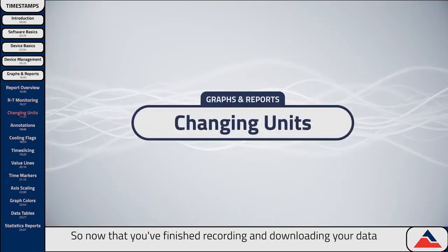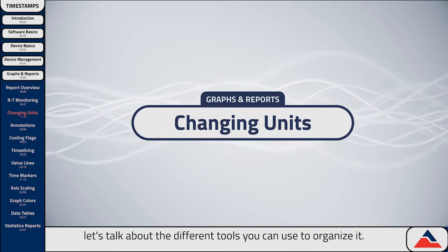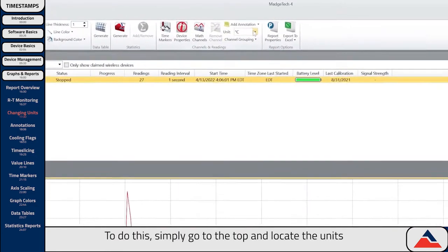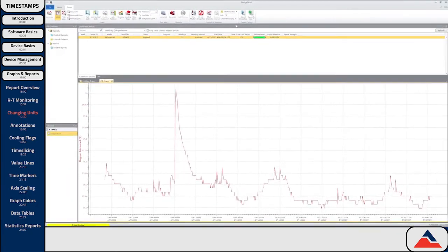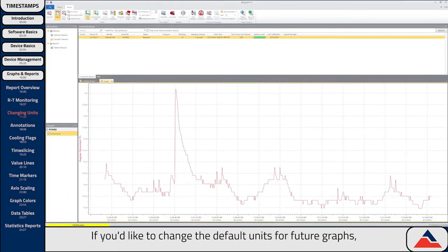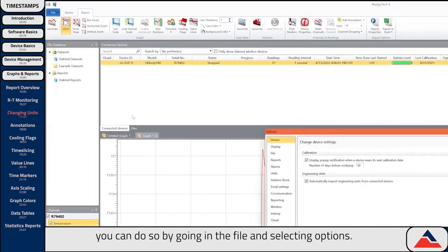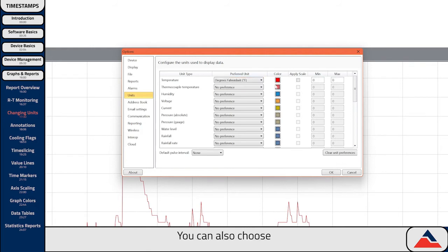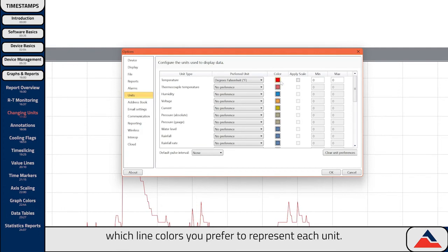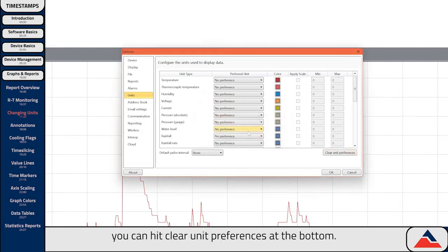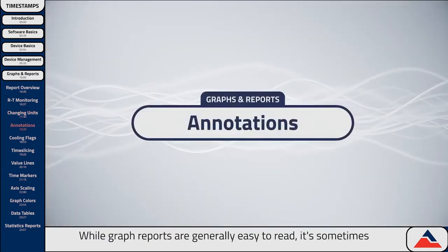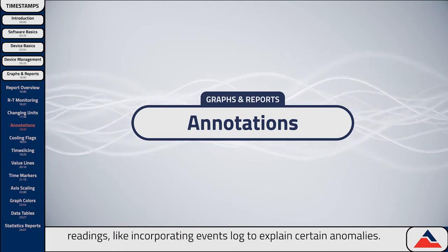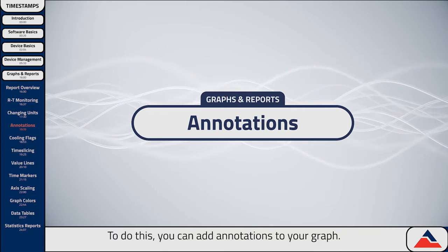Now that you've finished recording and downloading your data to a graph, let's talk about the different tools you can use to organize it. The first thing you'll want to know is how to change your units. Simply go to the top and locate the units drop-down menu and select the units relevant to your report. If you'd like to change the default units for future graphs, you can do so by going into File and selecting Options. Click the Units tab and you'll see all the different options available for different types of readings. You can also choose which line colors you prefer to represent each unit. While graph reports are generally easy to read, it's sometimes necessary to apply context to certain readings, like incorporating an events log to explain certain anomalies. To do this, you can add annotations to your graph.